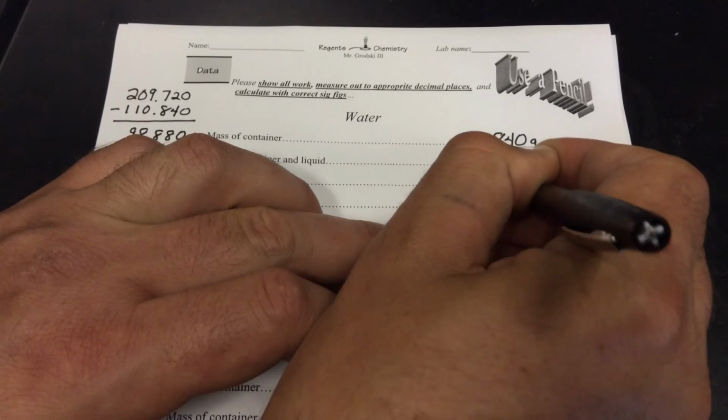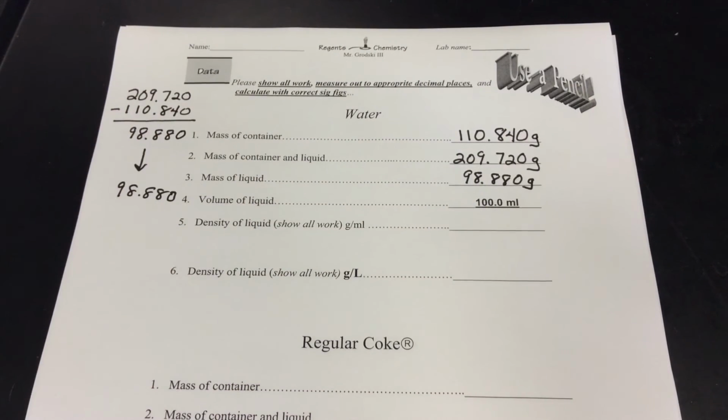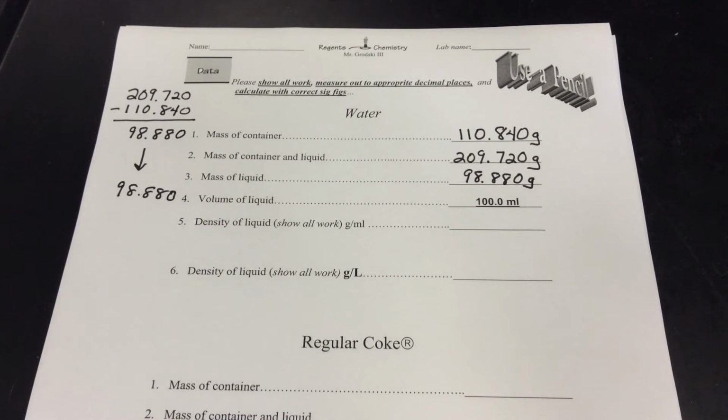So our value is going to be 98.880, and make sure I have a unit. Okay, there. Have a unit that tells me something about the type of substance or matter that I just measured. So 98.880.